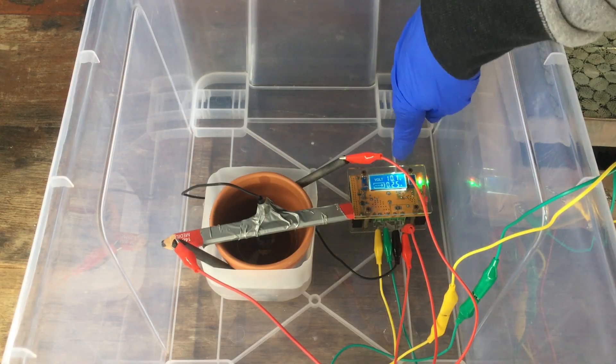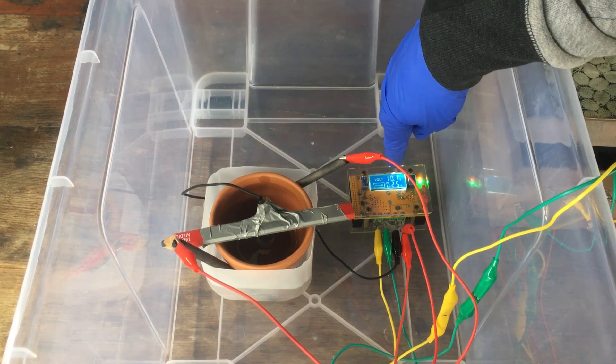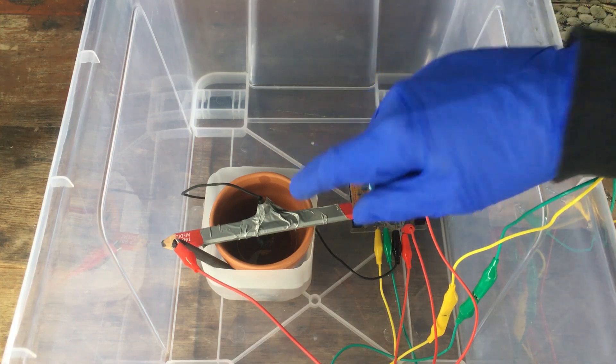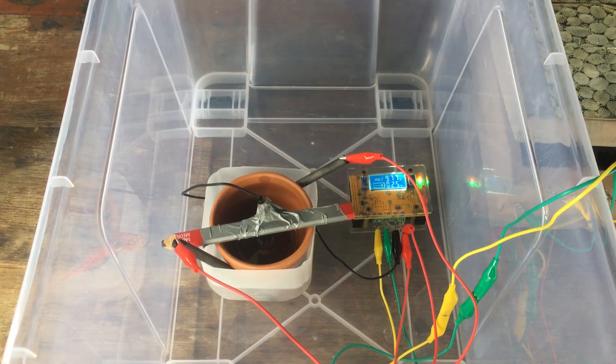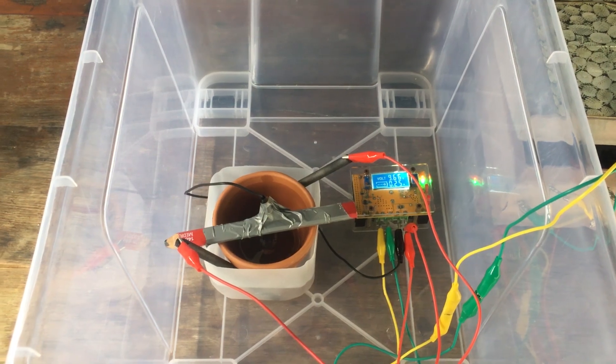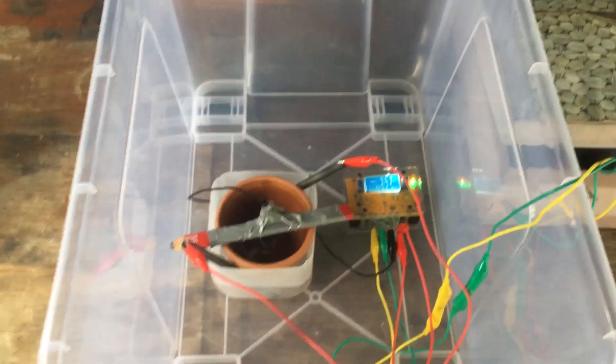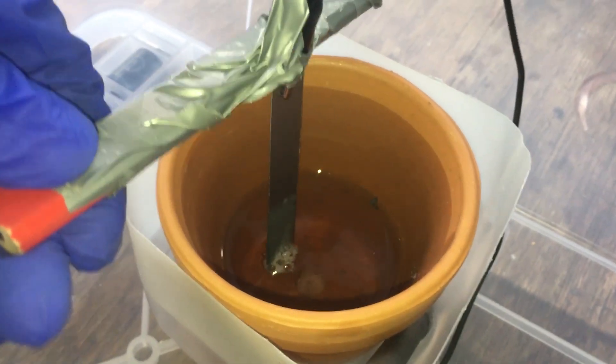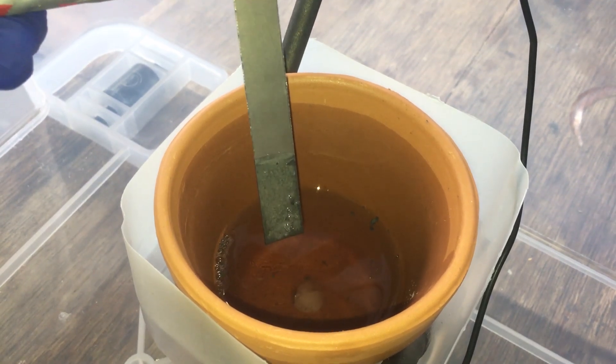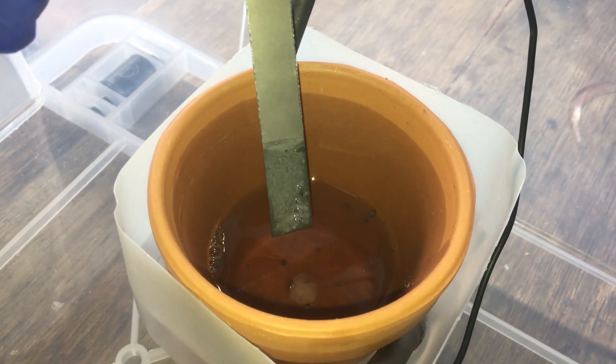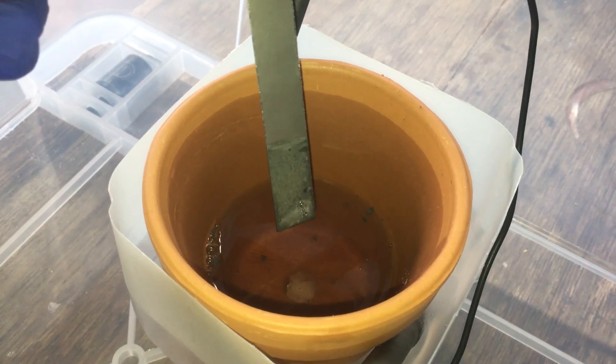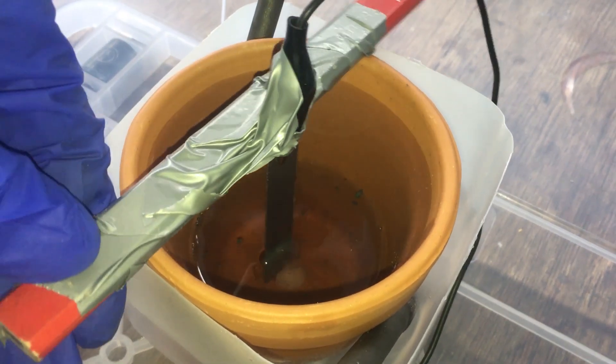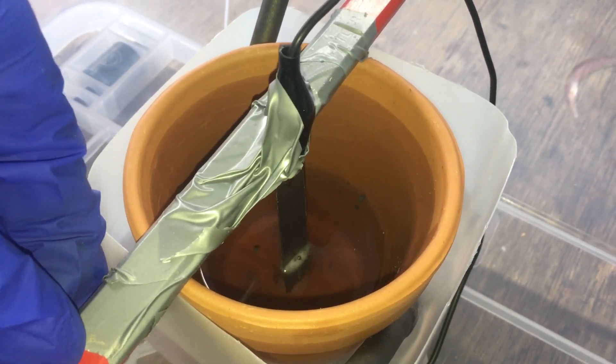And look at that already. After just five minutes, we've already hit our target current of a quarter of an amp. So this is good to just leave going for a few hours at least to get a good coating of manganese on our titanium strip. In fact, maybe if we have a look now, we might even see some manganese forming already. Oh yeah, there's definitely something forming on our titanium strip. I don't know how well it's adhering to the surface, but we'll leave that going for another few hours and we'll check back up on it.